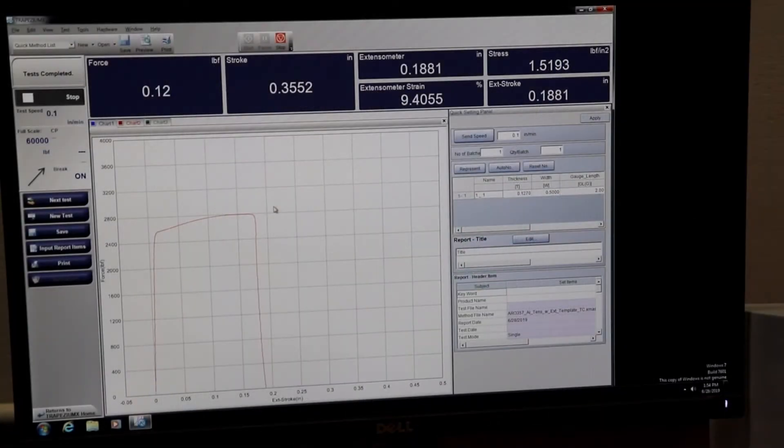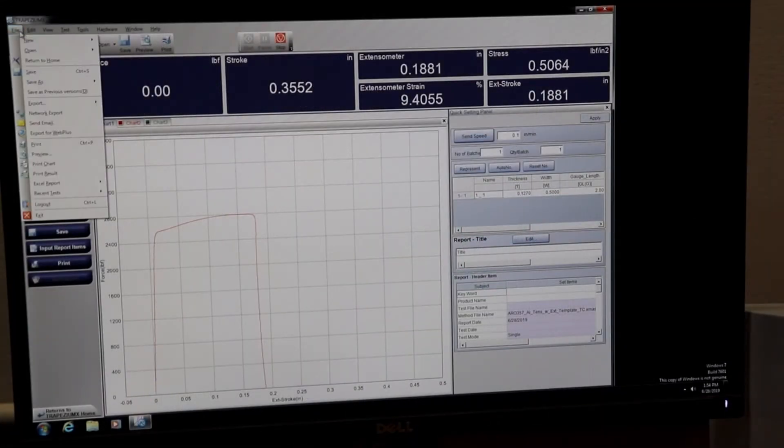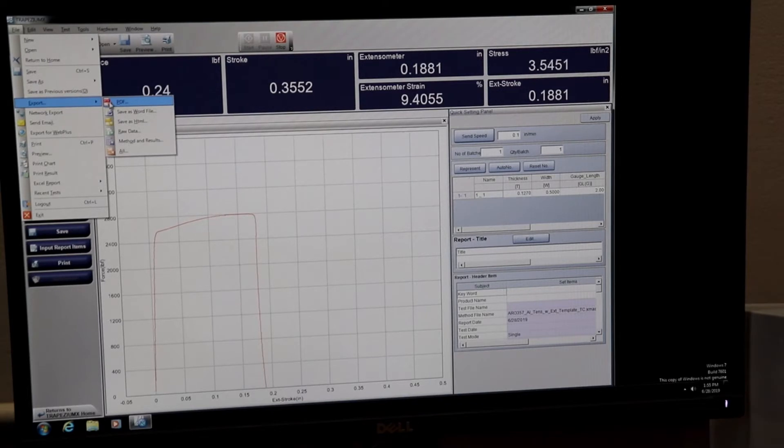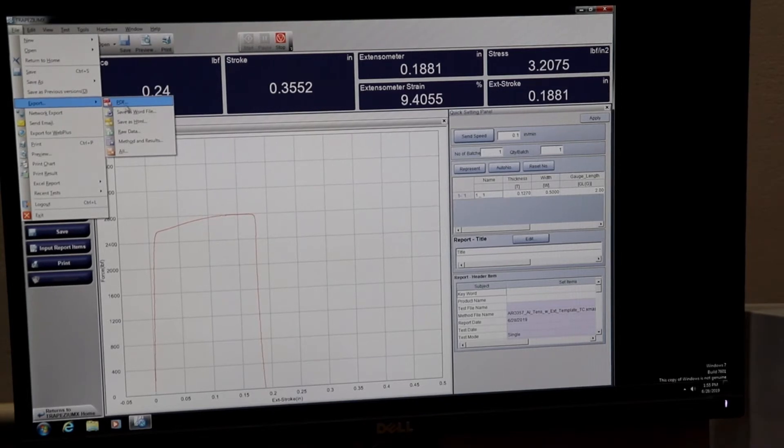We will now export the data for further analysis. To do so, we will click File Export Raw Data. We now name the file and save it to a place that can be retrieved easily.